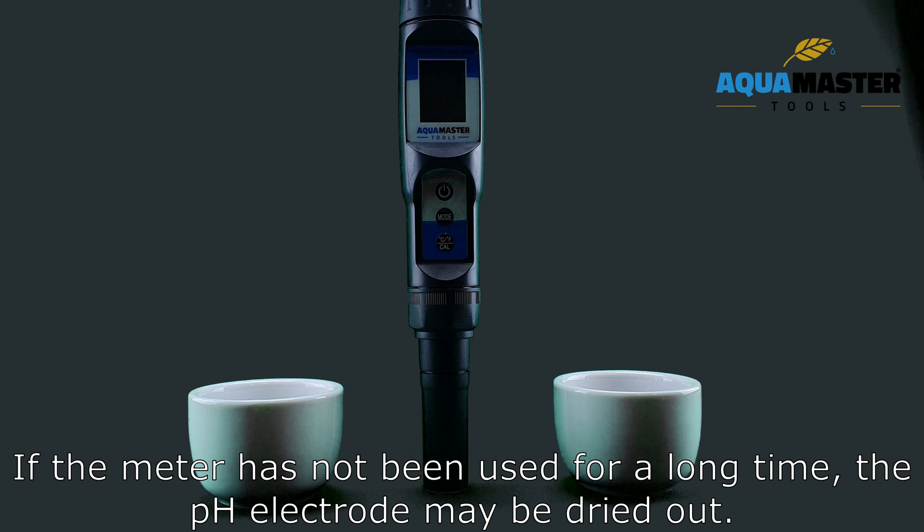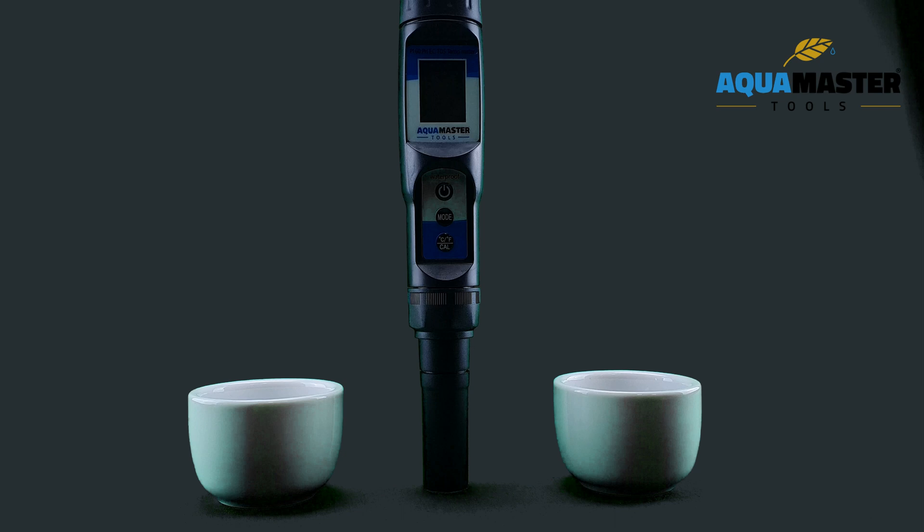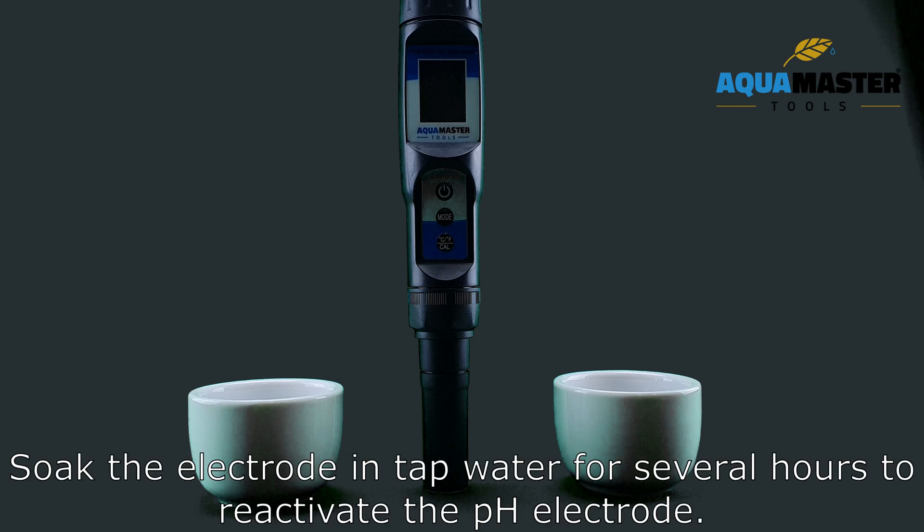If the meter has not been used for a long time, the PH electrode may be dried out. Soak the electrode in tap water for several hours to reactivate the PH electrode.